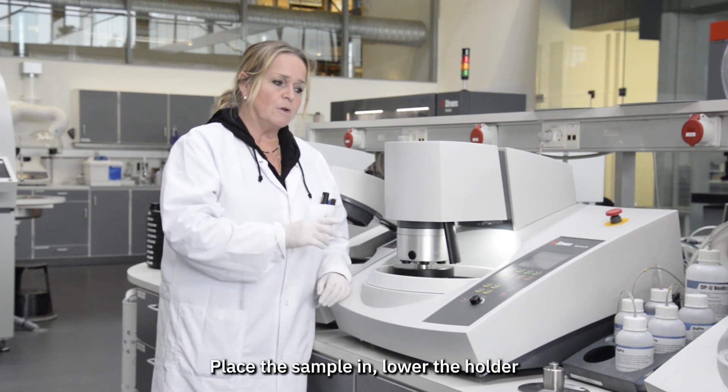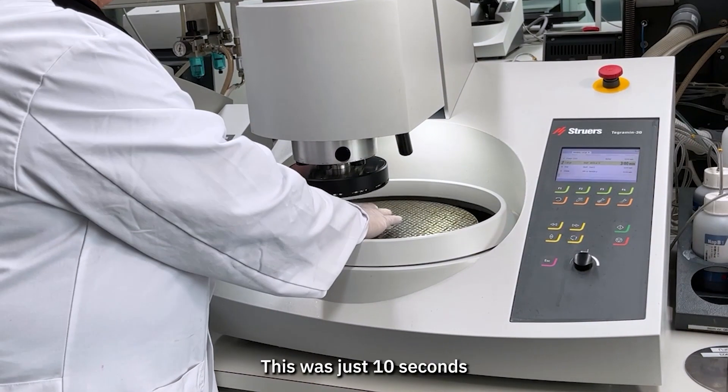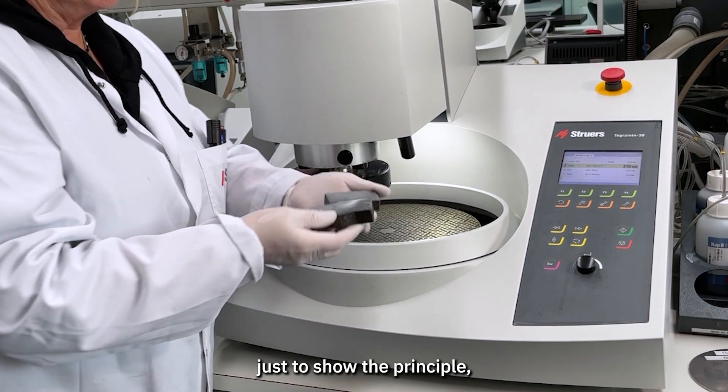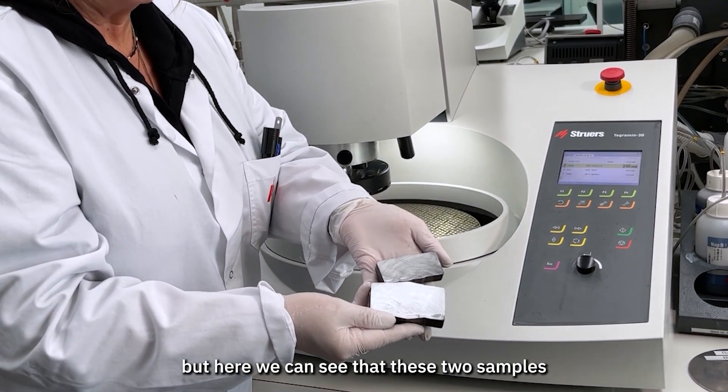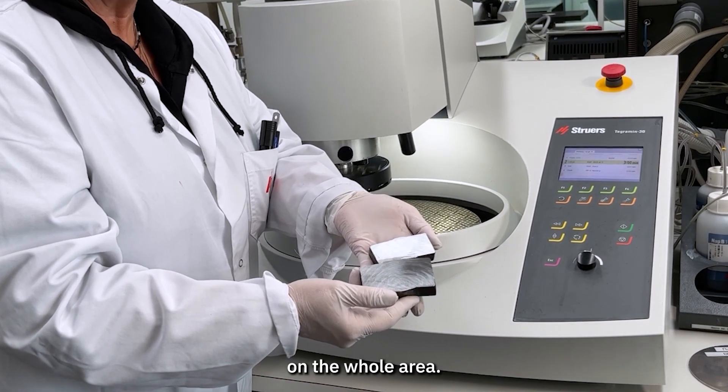Place the sample in, lower the holder, and start the process step. This was just 10 seconds, just to show the principle. But here we can see that these two samples have been completely plain grinded on the whole area.